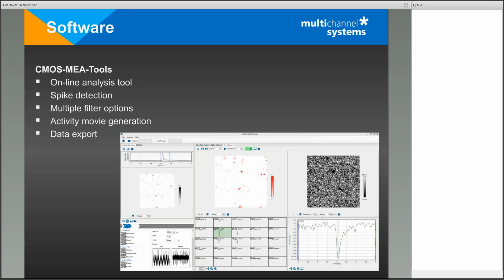So here again, we have a spatial and time-wise overview of the activity inside the file that you're replaying. And again, we have that graphical visualization of the data. And again, you can zoom in into the raw data, which you see down here.